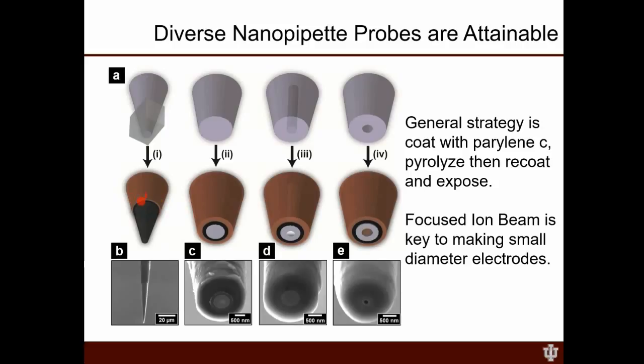We then overcoated that with an insulating layer, and that gives us a probe that has this needle-like geometry. This needle is a conductor on the outside, an insulator, a conductor here at the base, and an insulator at the tip, and this gives us another extra electrode.